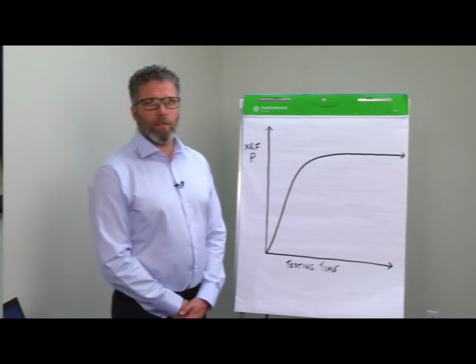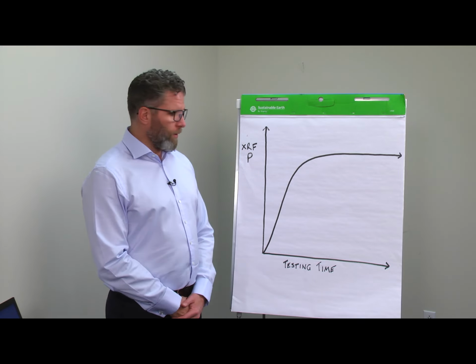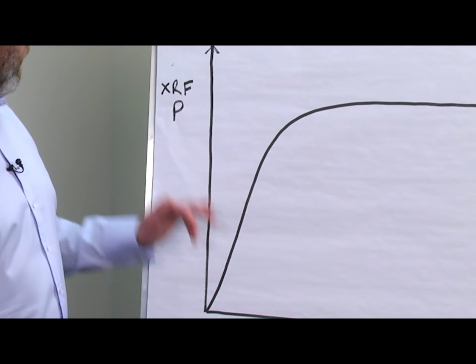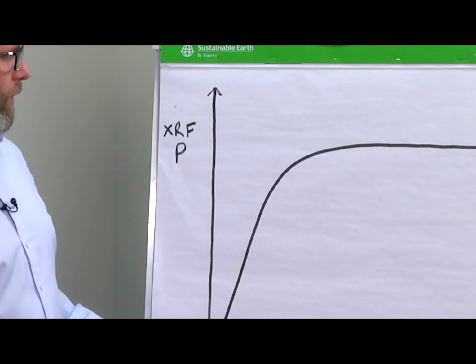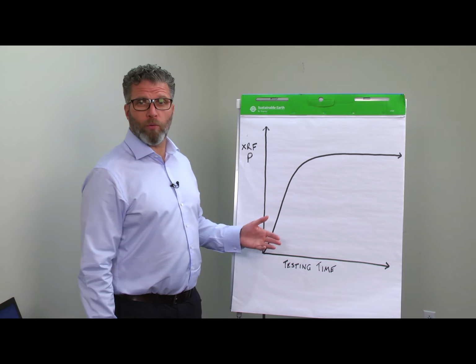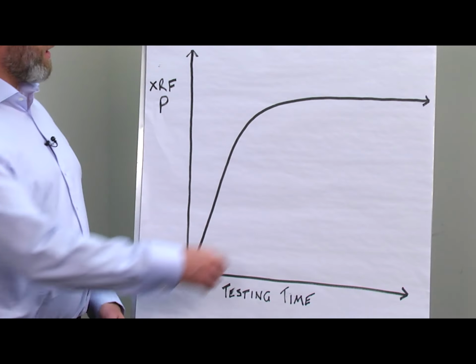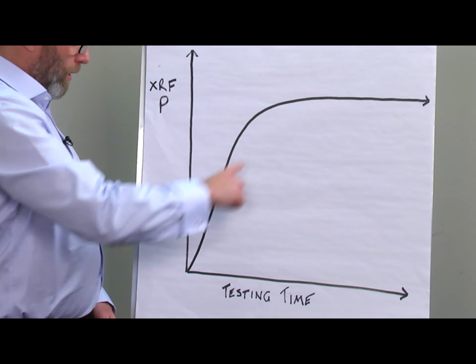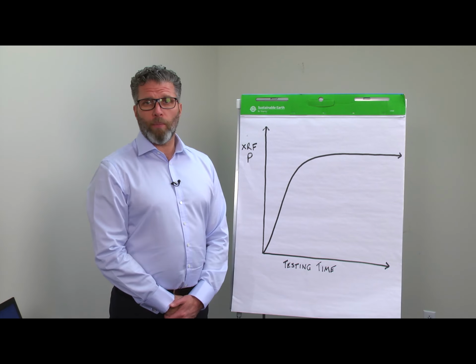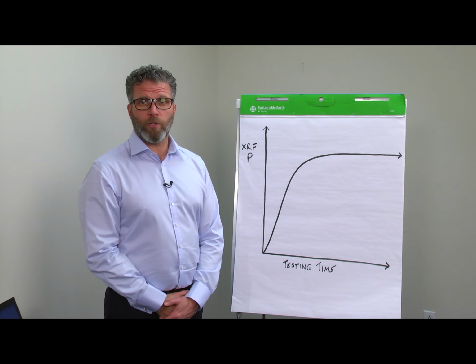It's that easy. So another way I like to show customers very simply how to achieve the optimum testing time is by a simple XY graph, with X-axis testing time and Y being the precision of XRF. Obviously, as you can see here, precision improves over a longer testing time, but the customer actually needs to find their sweet spot. Could be 120 seconds down here, or as little as 10 seconds sort of down here. Now let us show you an example within Excel of a customer achieving their optimum testing time for their project.